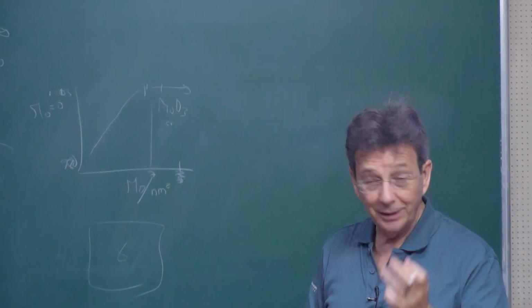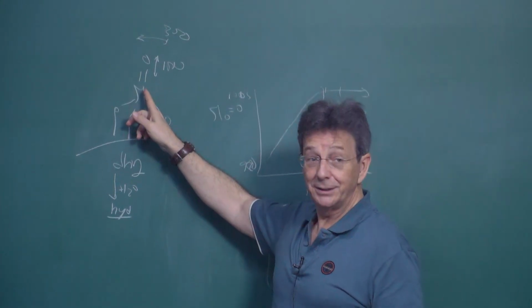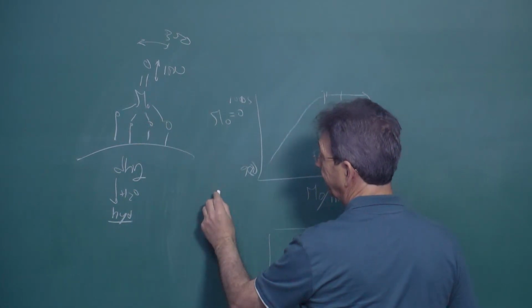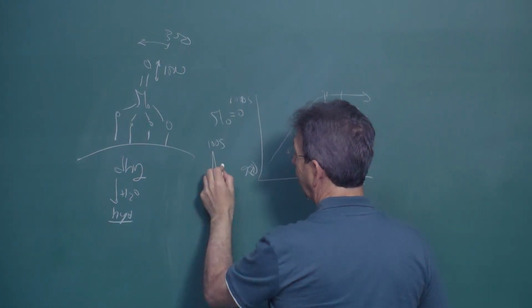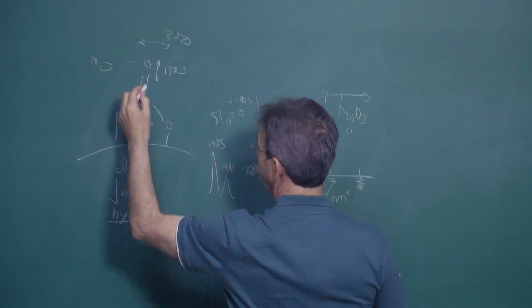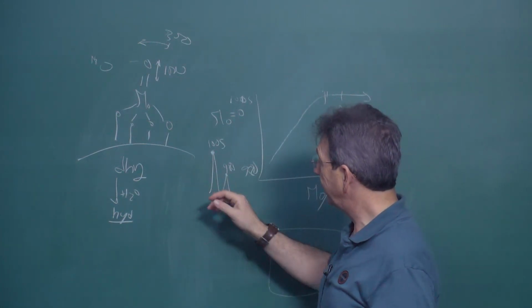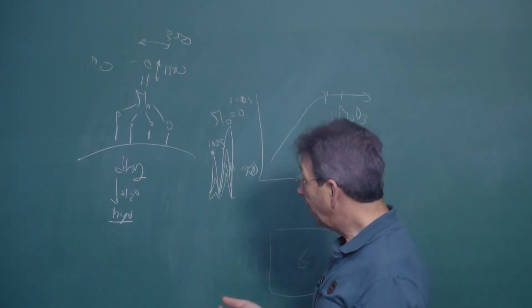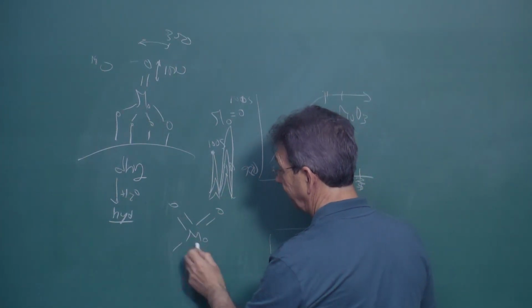And that is a very good question, because if you look at this vibration, it has the same frequency, and if you make an isotopic exchange with oxygen-18, basically you will see this vibration appearing at 1005 or at 980, depending on whether you have oxygen or oxygen-18, because of the reduced mass, but you only have one or the other, with or without isotopic labeling. So you have this or that, and progressively this one will decrease and that one will increase until there's nothing here and everything is there. If you have a dioxo, and you get oxo here, oxo there, and the metal here, for instance, molybdenum.